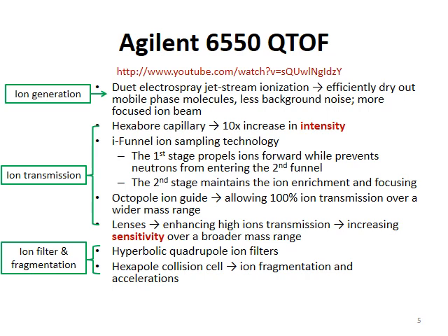So still, you will see the ion generation, as I have mentioned to you, the 6550 QTOF. They use so-called dual electrospray jet stream ionization technique. And using this technique, you probably see the mobile phase can be efficiently dried out. You probably will experience less background noise, and you probably can see more focused ion beam. So all this can contribute to higher sensitivity.